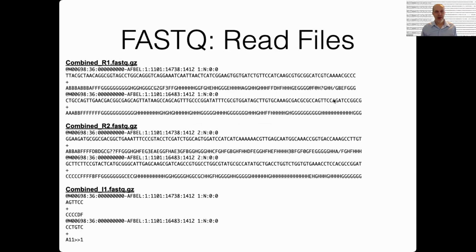Maybe not a very satisfying answer. But for Illumina, you can think about the algorithms that are used for Sanger sequence data. Those are publicly available, and you can look and think about how this translates to Illumina data.